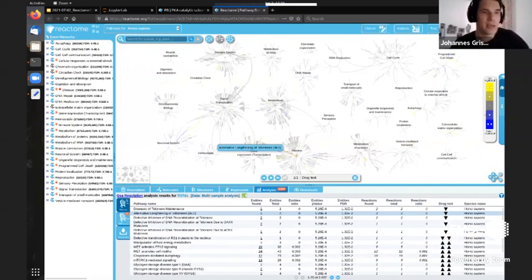And the last question I'm going to answer now: since long read platforms produce fewer counts per gene than short read platforms, does that reflect in the pathway analysis? No, that's the very neat thing. If you have different data sets, of course the same technology has to be used within one data set, but then it does not affect your data since you stay within the system, right? So even though you have more coverage, you still compare to the same thing. And then you normalize it on pathway level. So no, this is not a problem.